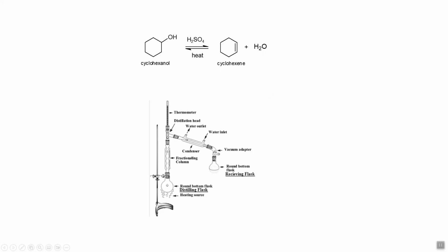I'd like to thank Katie for this because I watched her do this last Friday, and that is helping me out a lot because there are a lot of practical details here, just based on the complex nature of how this is all set up. So make sure you're familiar with how to set up a fractional distillation apparatus before you come to lab, because you don't want to spend a long time setting this all up, because you want to get the reaction moving along.